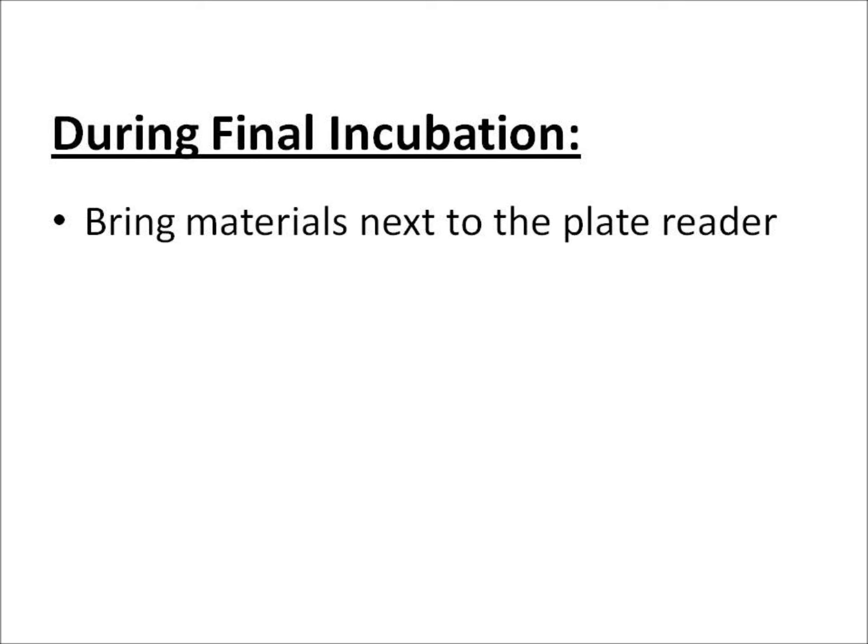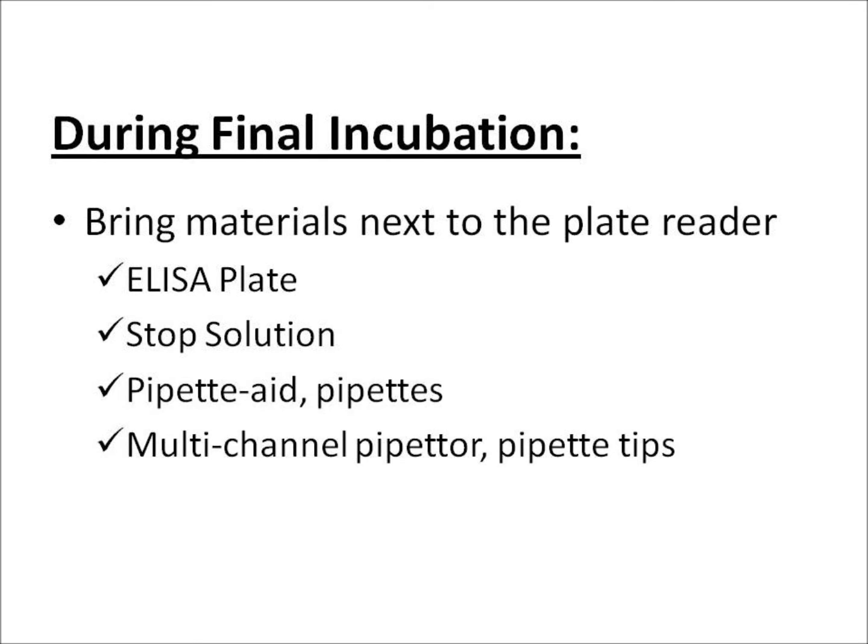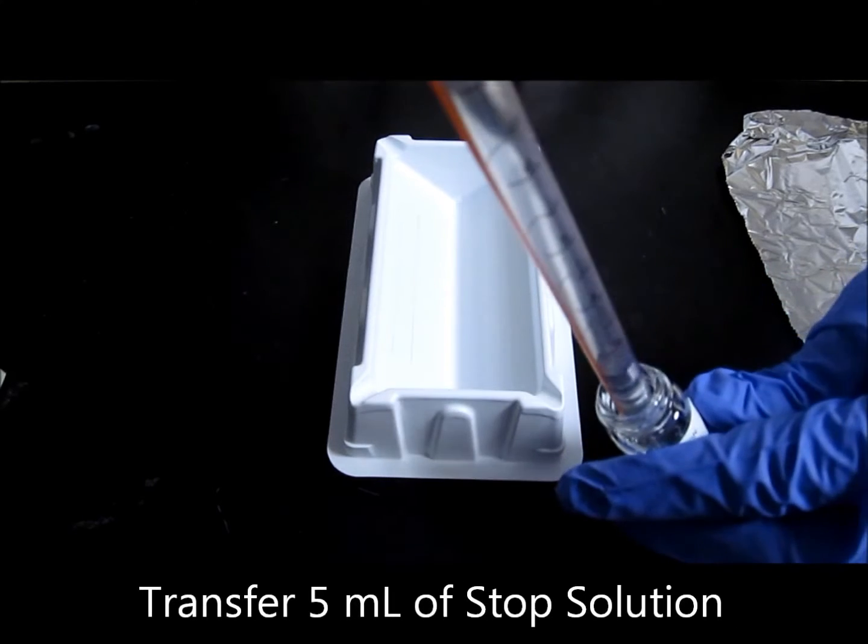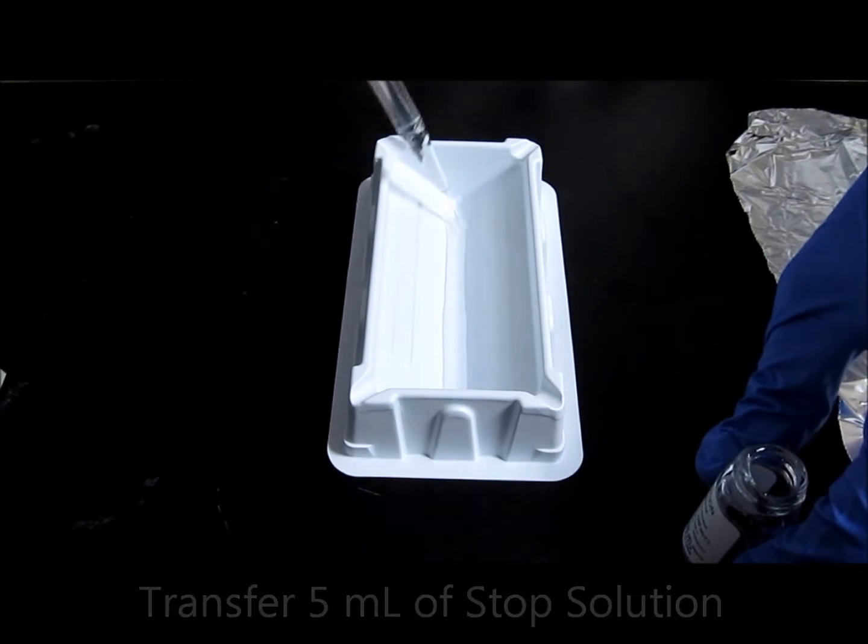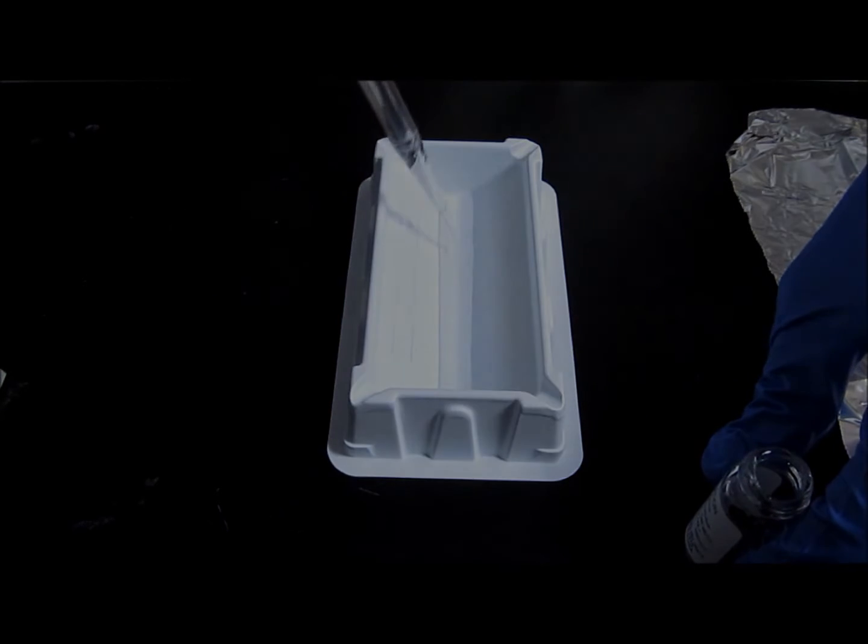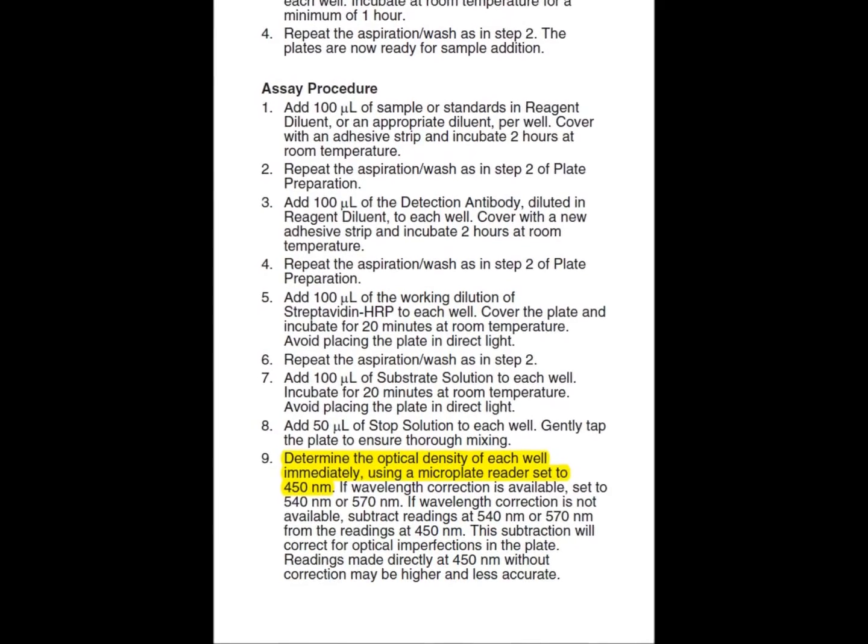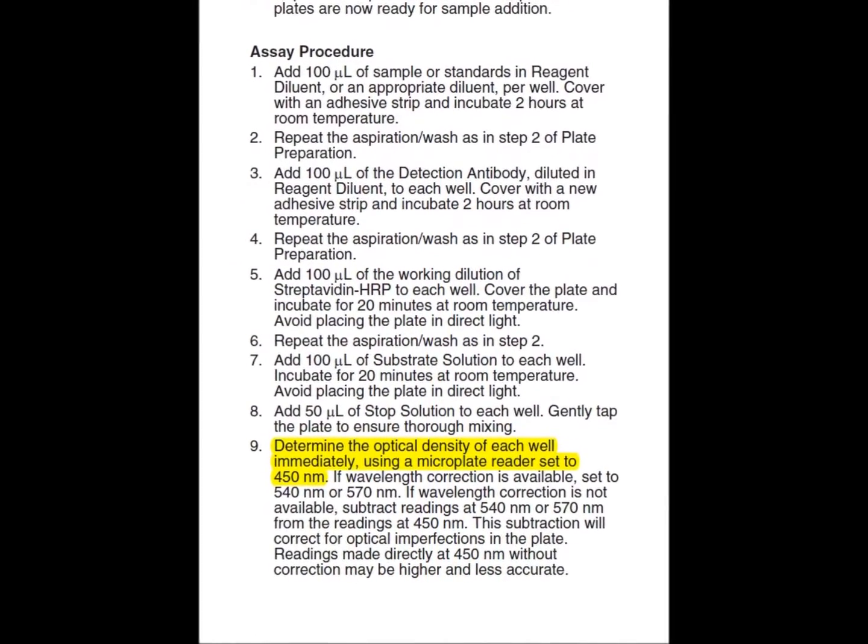During the incubation period, bring the ELISA plate next to the plate reader along with the stop solution and pipetting equipment. Be careful when handling the stop solution because it is a very strong acid. Transfer 5 milliliters of stop solution to the reservoir and set your multi-channel pipetter to 50 microliters. Program the plate reader to read absorbance at the wavelength indicated by the manufacturer. That would be 450 nanometers for this kit.